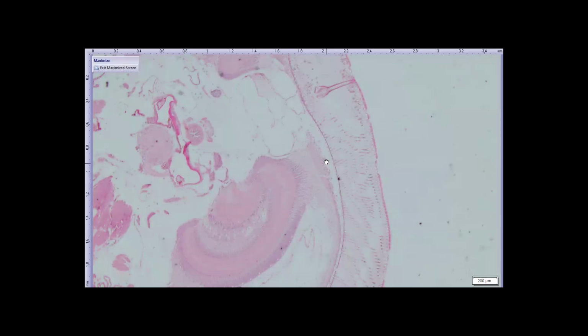And if we go to lower magnification, you can see that in the planar section, we only have the optic lobe contiguous with the eye in this portion. It would be contiguous all along here. So it's a very complicated laminated structure about which I know nothing, except it's the first line of visual processing. And then there's a central brain as well.